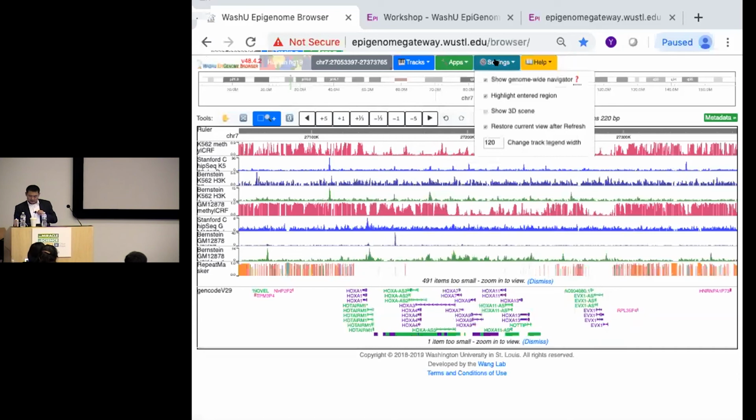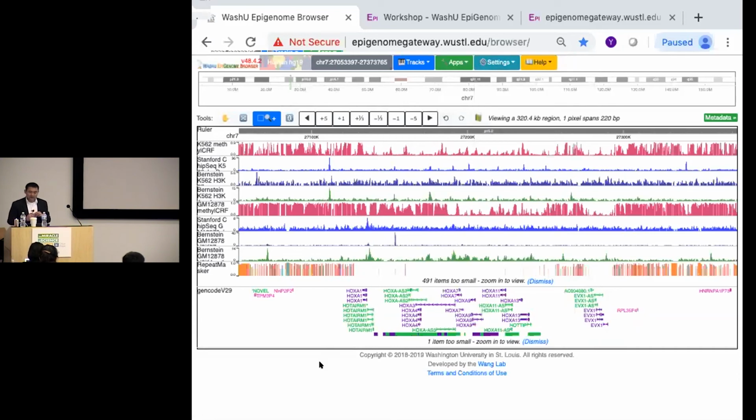So next, I will show you how to look at Hi-C data.